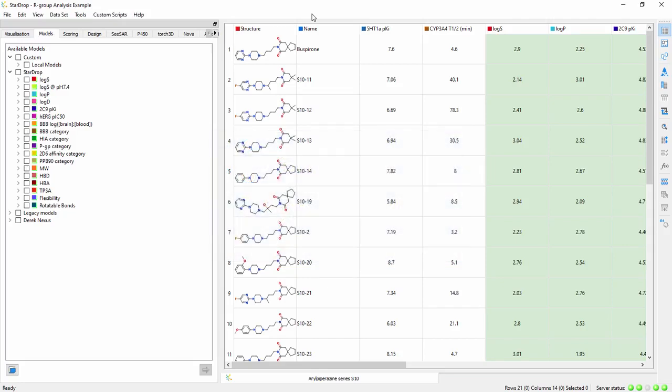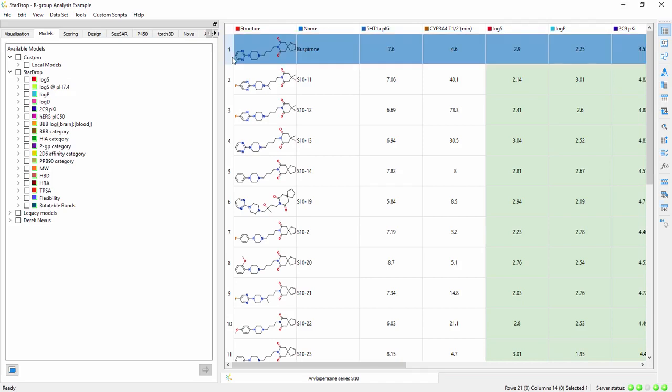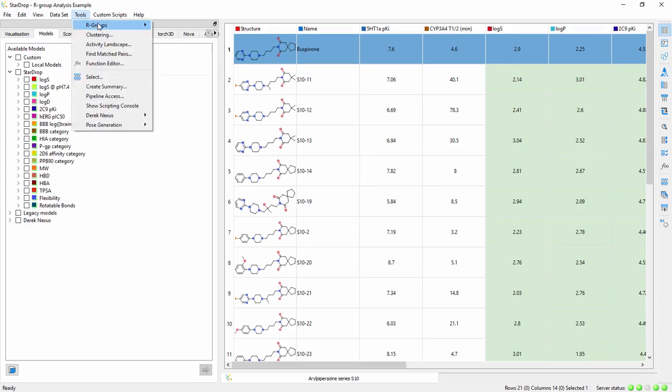The R-group decomposition tool enables you to analyze how compound properties vary by substituent within chemical series. Start by selecting an example member of the series. In this case we'll pick Buspirone and choose the R-group decomposition tool from the toolbar or the Tools menu.